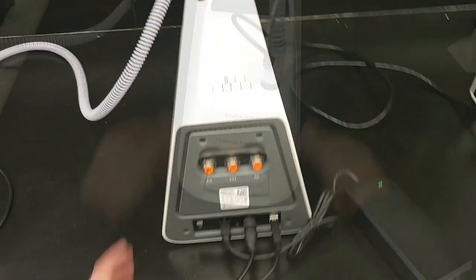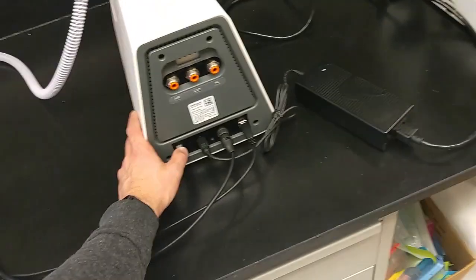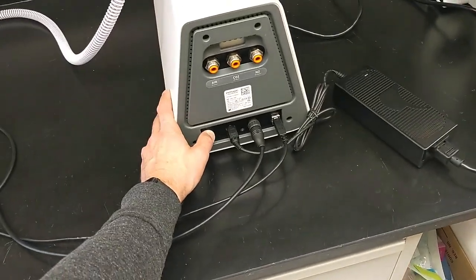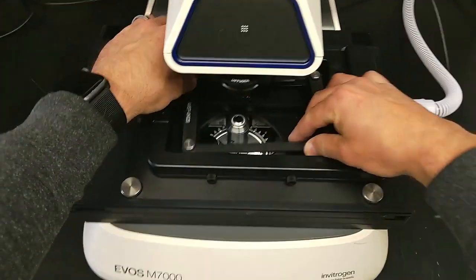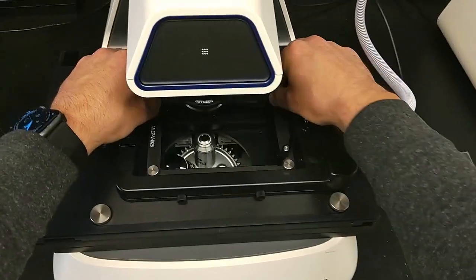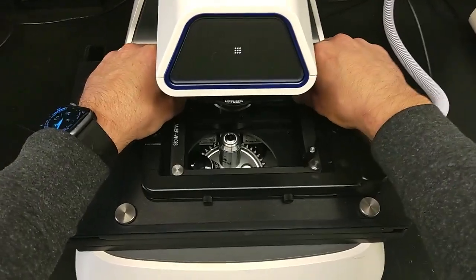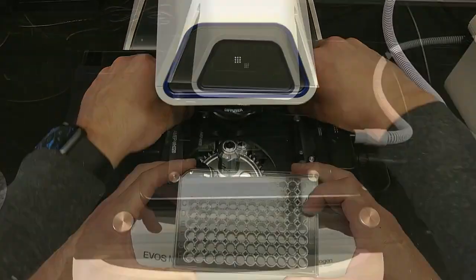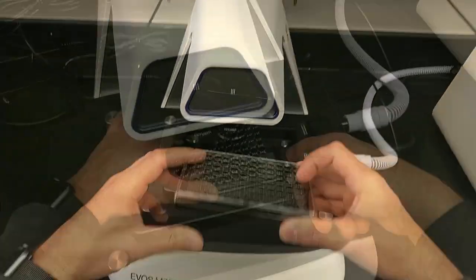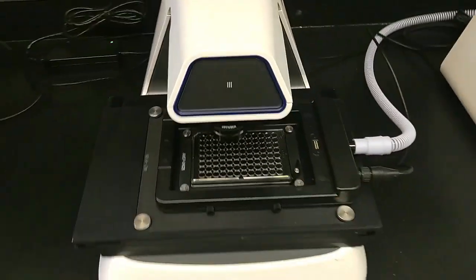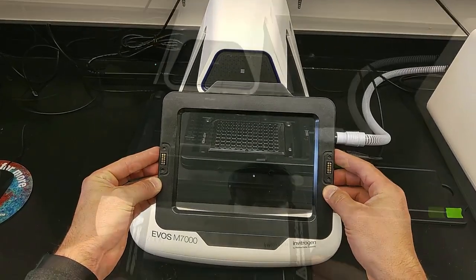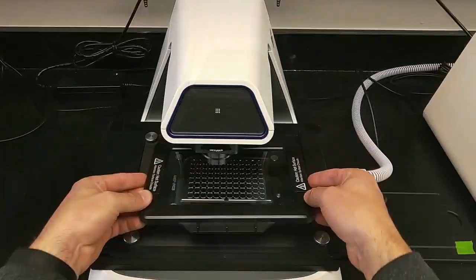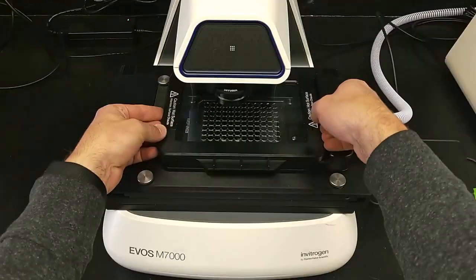Power on the OSI and microscope. Install the appropriate vessel holder into the stage top environmental chamber and place the vessel into the holder. Place the heated glass lid onto the environmental chamber.